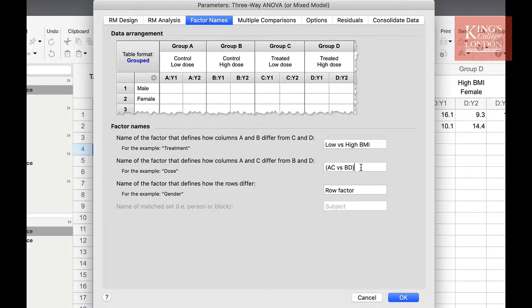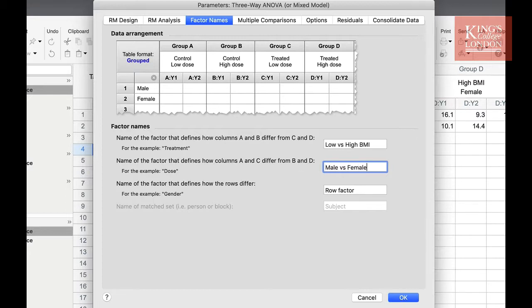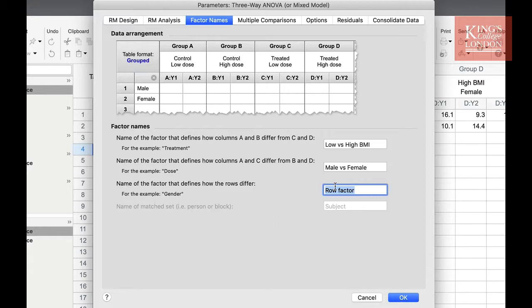We then need to label the factor that defines how columns A and C differ from B and D. This is going to be male versus female. Finally, we need to label the row factor, and in this case this is the degree of smoking, so low versus high smoking.